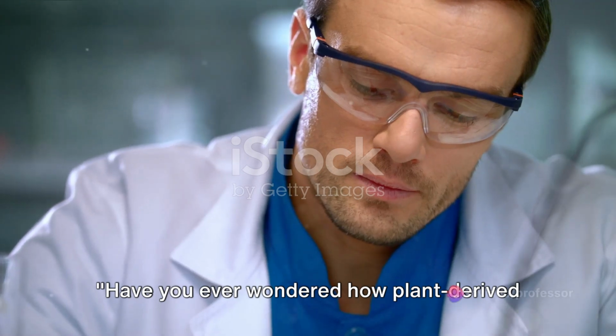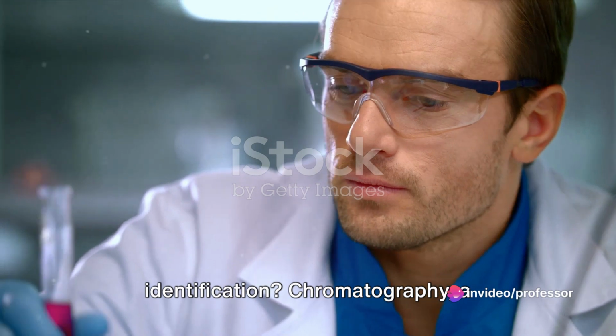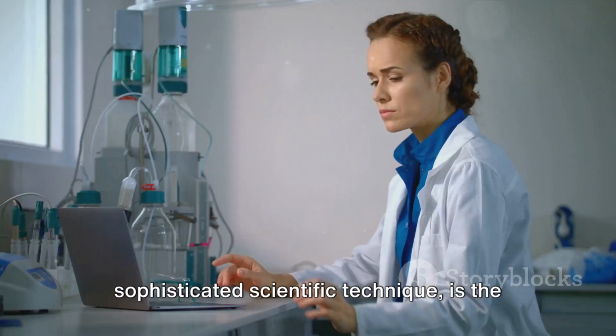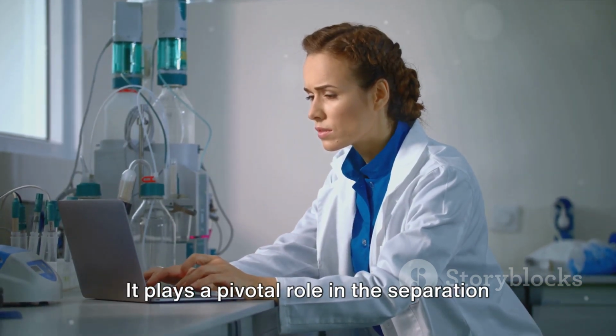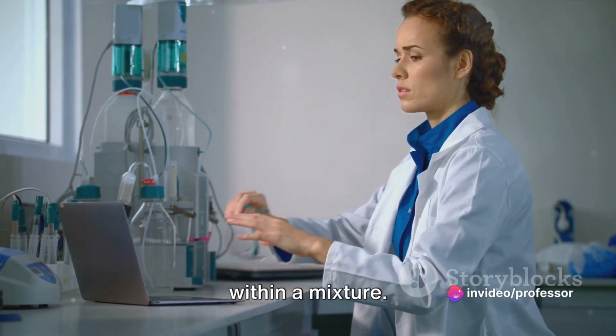Have you ever wondered how plant-derived products are separated for analysis and identification? Chromatography, a sophisticated scientific technique, is the unsung hero behind this process. It plays a pivotal role in the separation and identification of different components within a mixture.